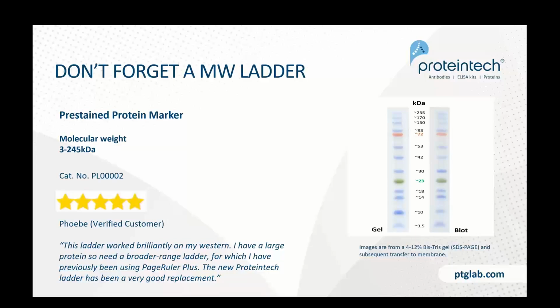So that last one is the standard one that people use. This one is if you're looking at a broad range. It goes from 3 to 245, so enormous proteins can be used. This is best for huge proteins or really, really small proteins. And this one's also relatively highly reviewed as well.